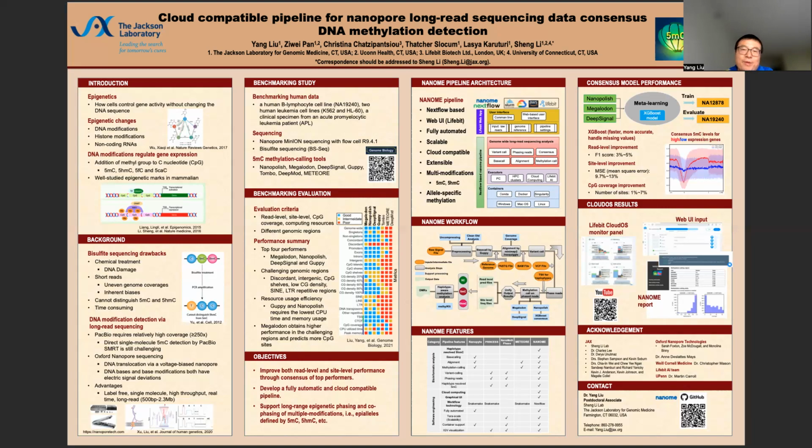Currently, no pipeline integrates and automates DNA methylation detection for nanopore sequencing using cloud computing.